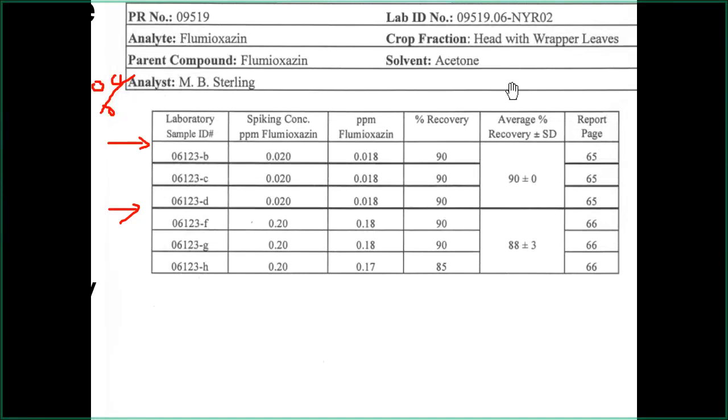The format is different because they do not show the control here, and the numbers do not give meaningful information, which is fine as long as in your lab it's restricted this way. The significant figures are also different, and that's good enough for our purpose. I will show you what the situation is in my lab. So yes, the samples are triplicate, 3 different extractions.